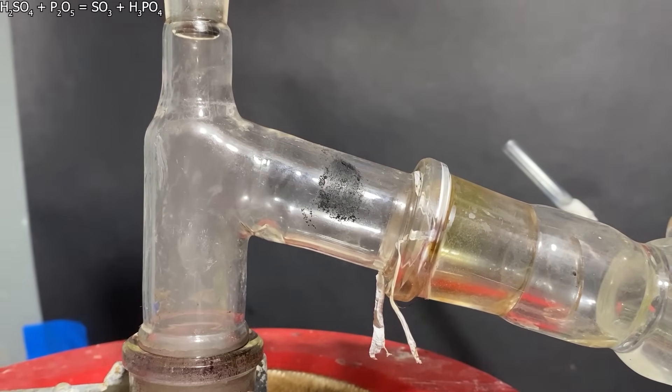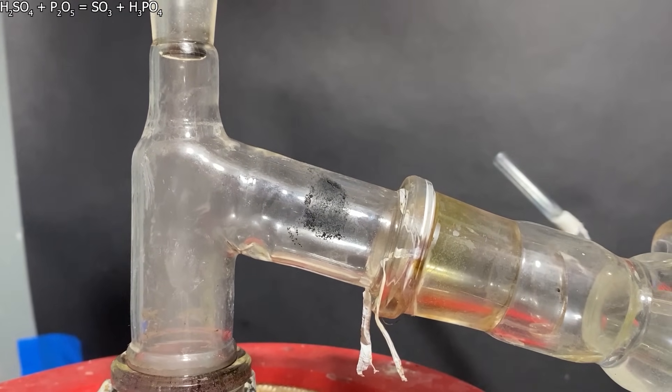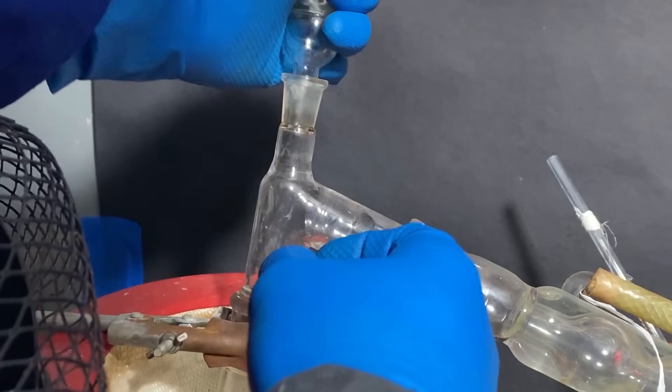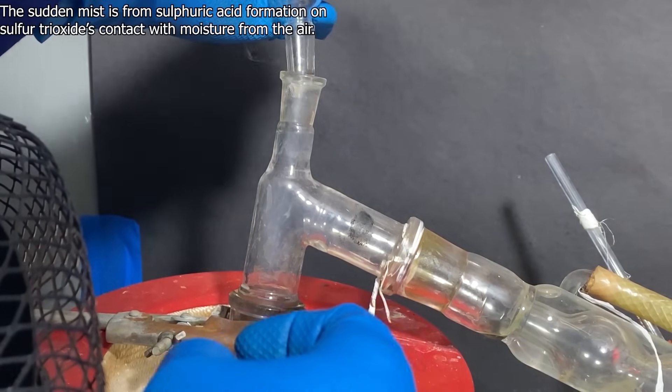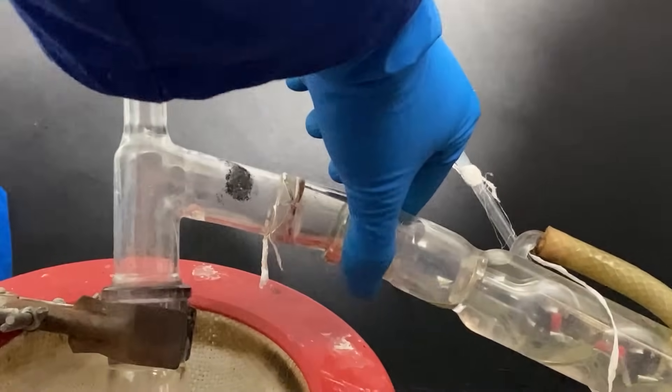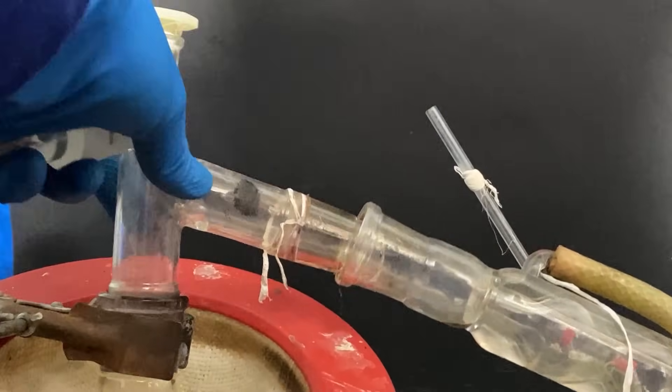I thought the reaction would take off immediately, but I guess we need to give it a little push by heating it up. As the reaction goes on, the sulfuric acid in the condenser gets this blackish tint, which means it has picked up some sulfur trioxide. After around an hour, I felt that the reaction was finally finished.